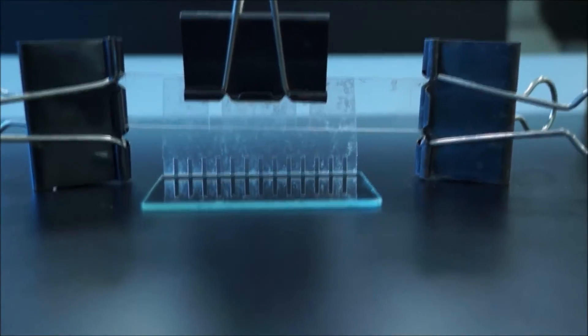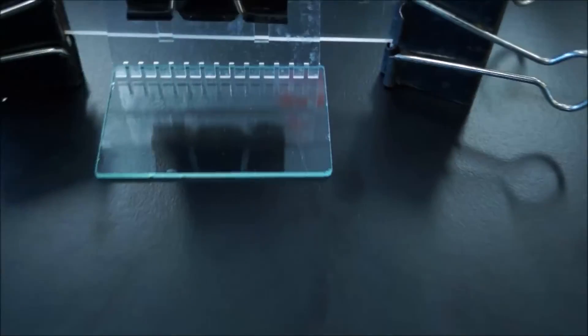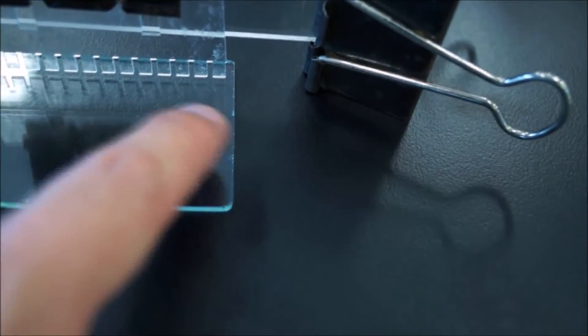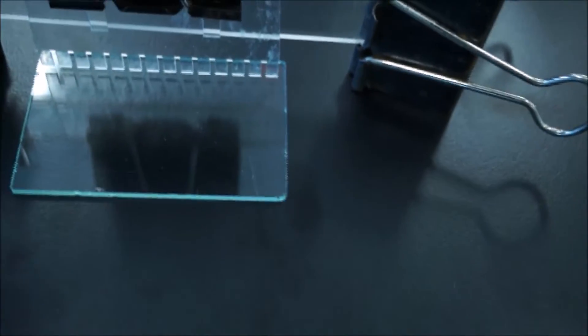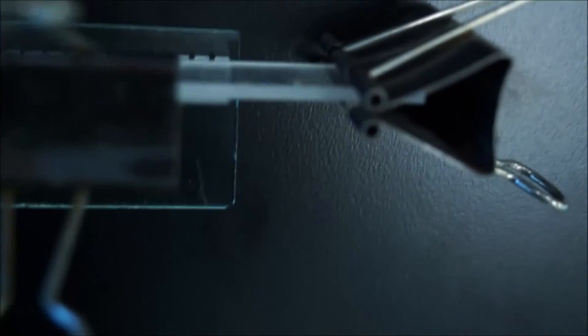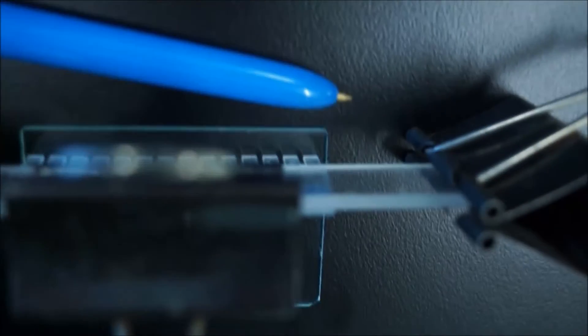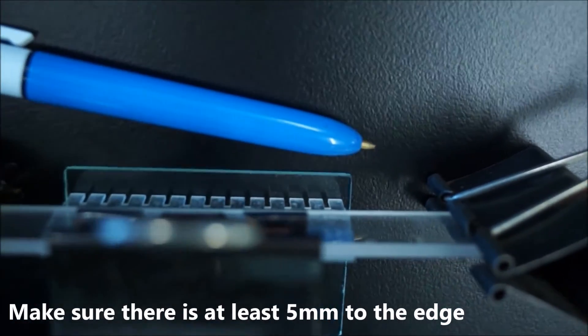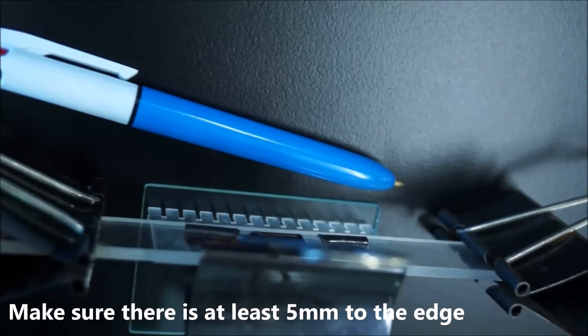The other dimension you want to be aware of is length. Make sure you put the comb along the length of the glass slide rather than the short edge, because you won't have enough space for all the wells along the short edge. And make sure it's not too close to the edge at the back. You want maybe 6 or 7 millimeters to the edge so all the wells will form up properly.